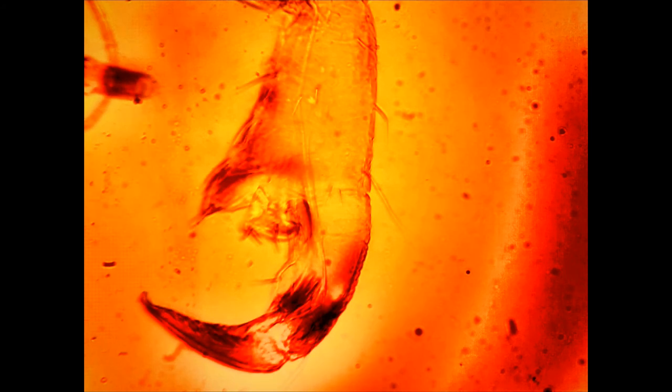Unfortunately, I'm unable to provide an image for the highest power x60 lens number six, as the specimen slide has quite a thick cement sealing ring to the cover slip, making it too thick to be mounted between the stage and the turret plate.